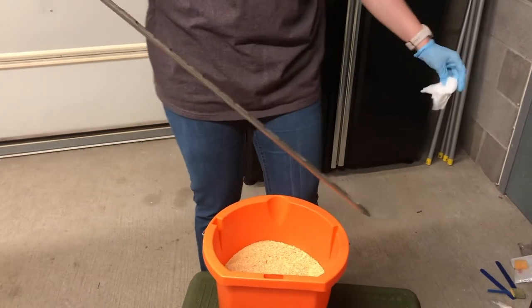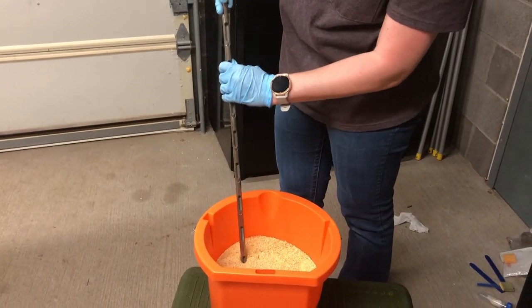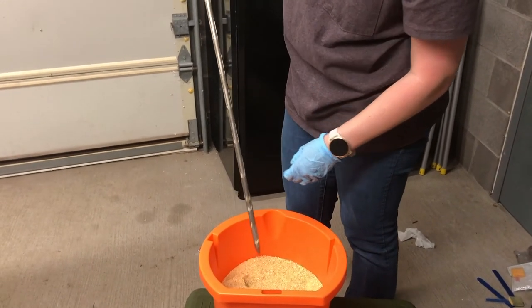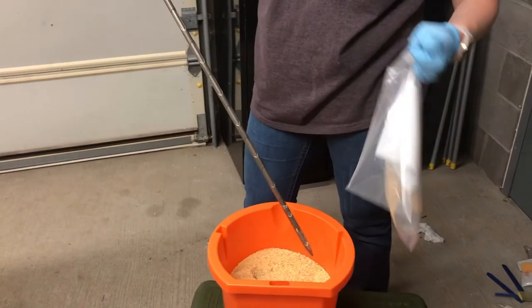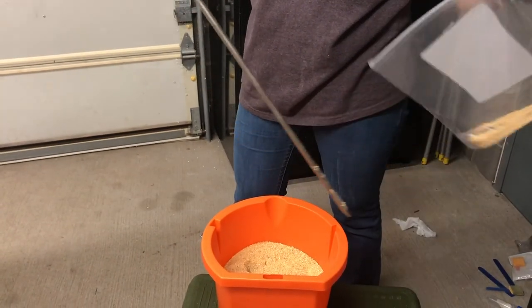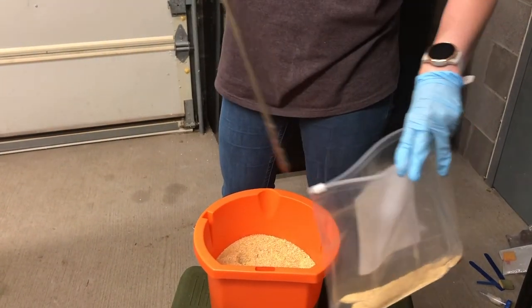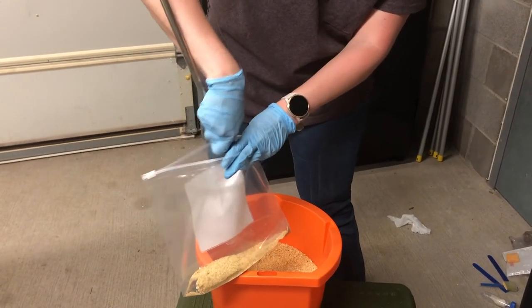Then insert the sleeved tube into the feed that you want to sample with the square compartments open. Then rotate the inner compartment to close the open rectangles to collect a feed sample. Withdraw the feed probe from the feed and dump the feed located in the internal compartment into a bag.